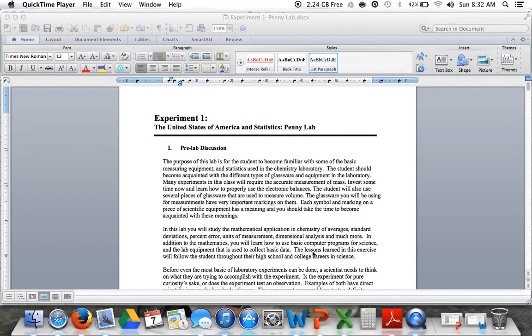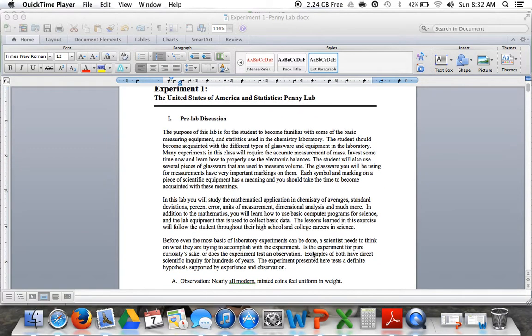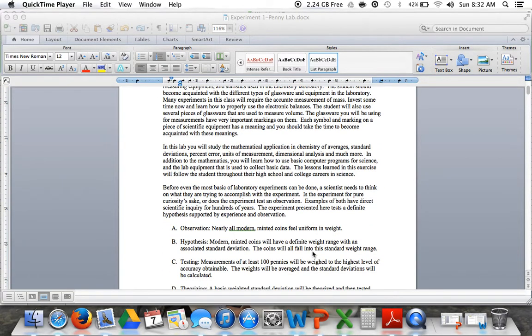Alright, we'll have a special scale for you guys to use. It'll be quick and easy. It's a digital scale for mass. But you need to learn these properties of the different pieces of equipment in the lab. How many sig figs does a graduated cylinder have? How many sig figs will you measure mass to? How to do math with those different things. If you learn those now, it won't be hard later on in the year.